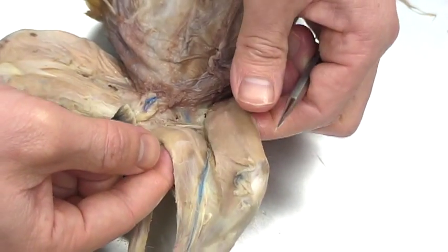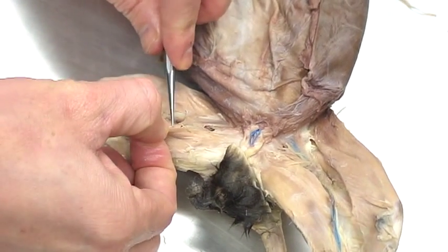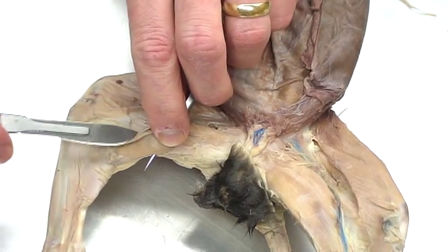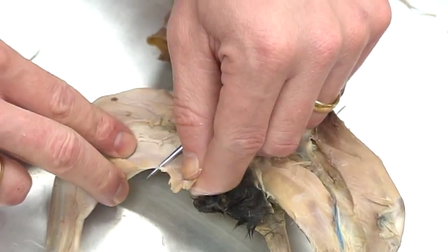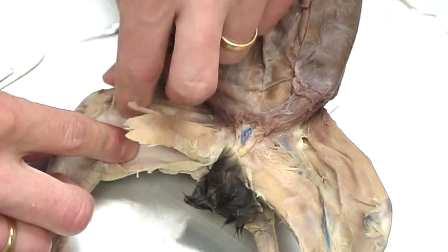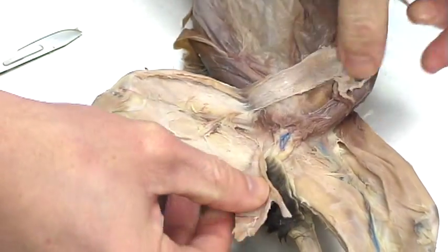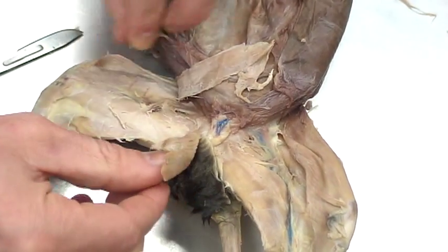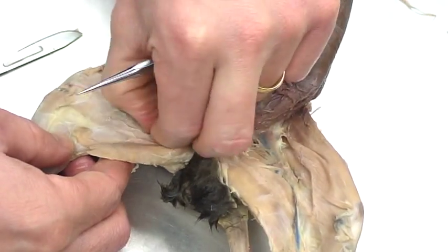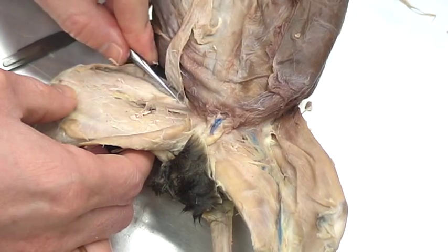Just like with the sartorius, I'm going to leave the gracilis intact on one side and reflect it on the other leg. I take my scalpel, cut at the distal end, and peel back that muscle. I'll do the same thing to the sartorius and pull that back. This lets you see how thin it is, and also exposes the underlying muscles we'll be identifying. I'll clean up a bit of fascia — this cat has a little bit there.